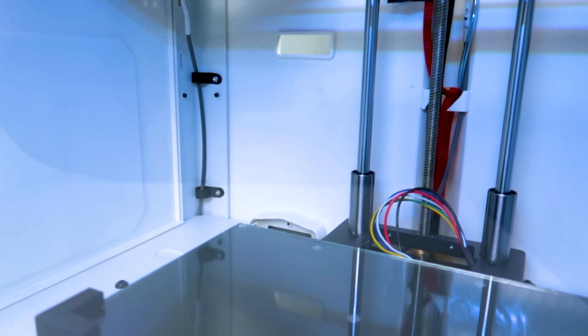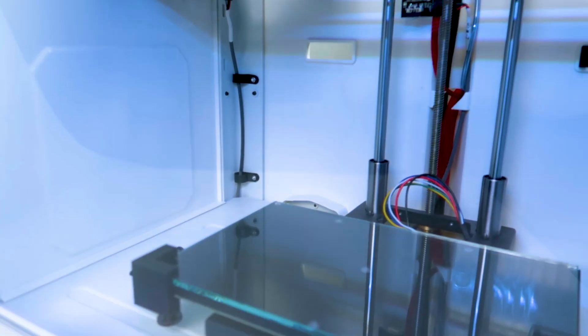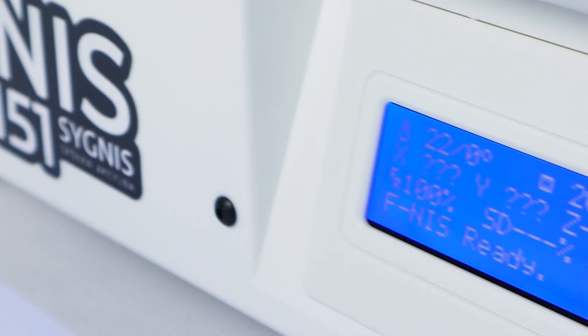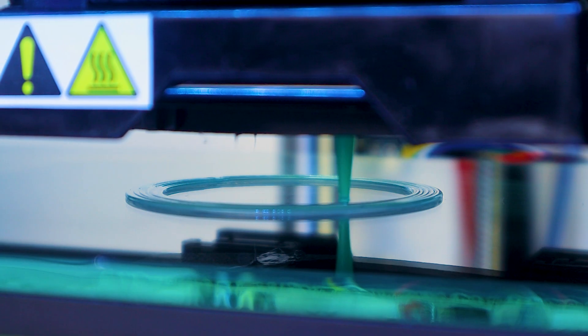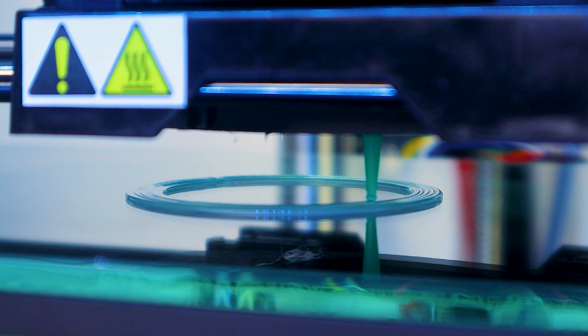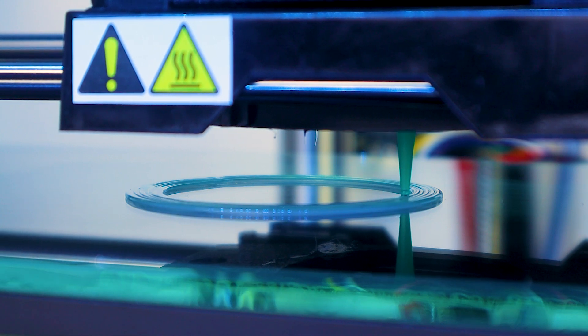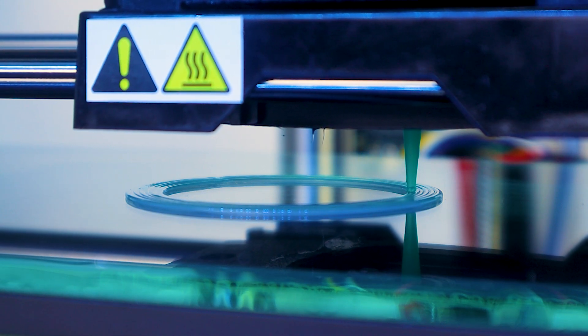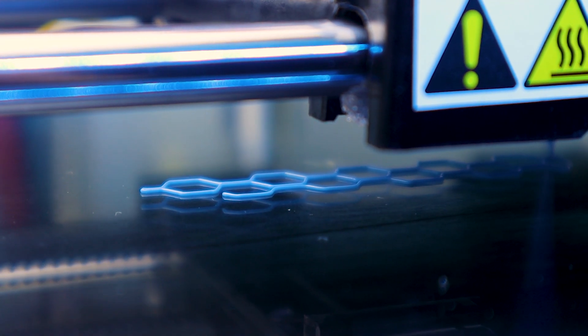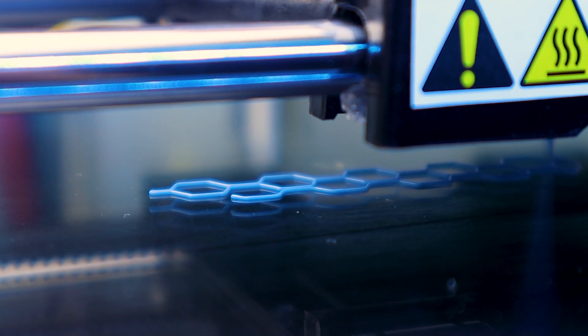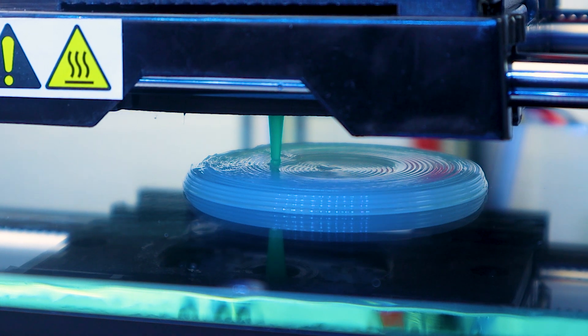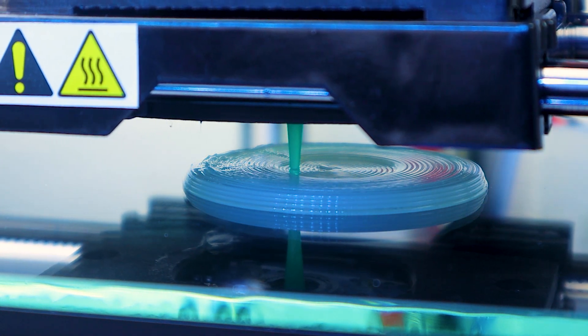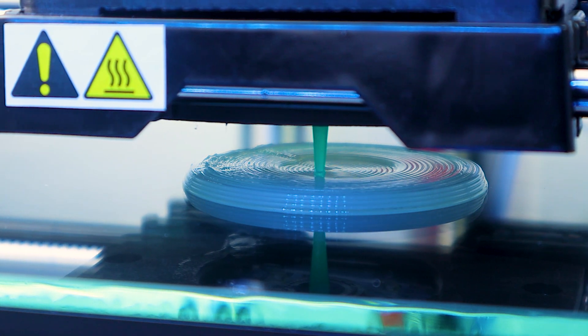With the FNES 3D printer, it can be any semi-liquid material. We provide you with a simple and reliable tool for exploration and research of new materials, helpful in the initial stages of proof of concept or as a universal base for prototyping.